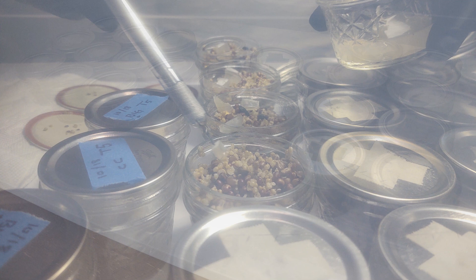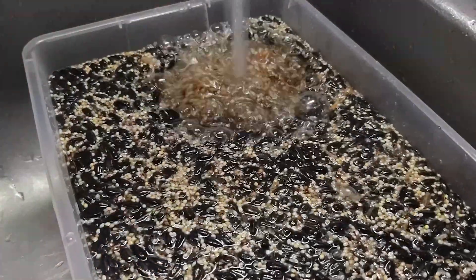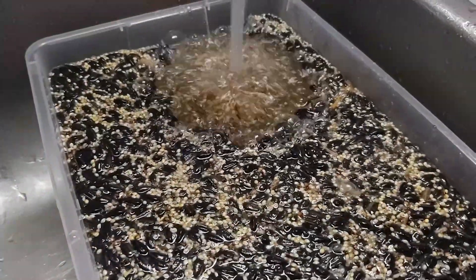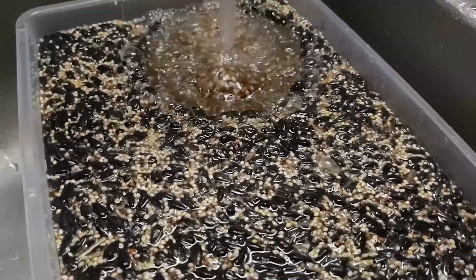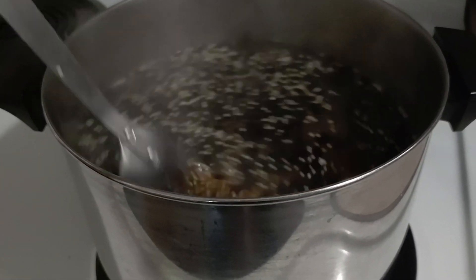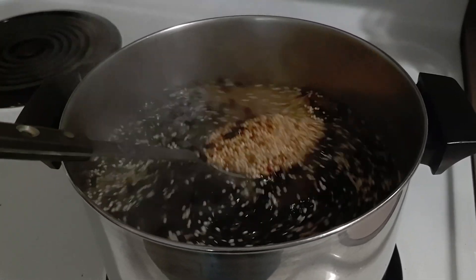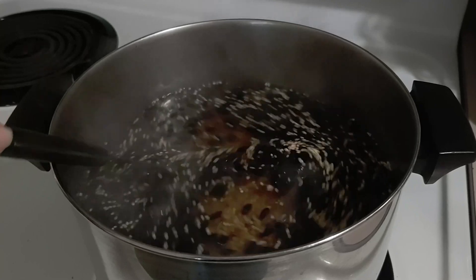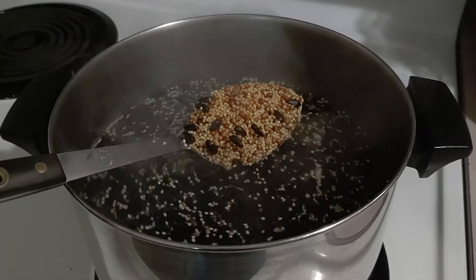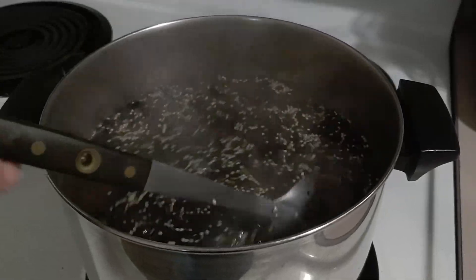When we began researching different WBS techniques, all we could find was people using tap water to rinse their bird seed for 20 minutes before boiling it in tap water for another 20 minutes. I'm sure this technique works for some people, but it didn't make sense to us. This got us thinking about different techniques and ways to prepare bird seed using the simple idea of cleansing and sterilizing while retaining all the nutrients.